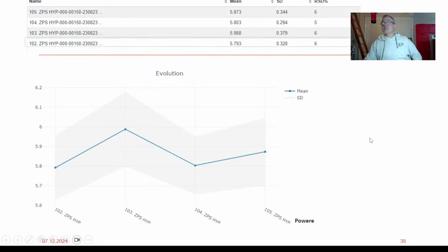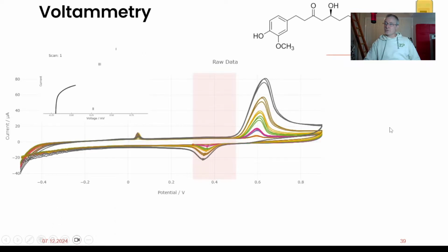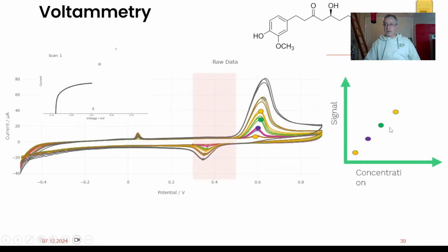Now, I will show you several days' worth of data, but just to say, it's a philosophical thing: sometimes when people ask me questions and I say, oh yeah, screen printed electrodes are good quality, I am definitely thinking about this type of application, the blood glucose type application, or the quick test I just did. I'm not necessarily thinking about some long-term testing in water. So we do have great repeatability, and we are able to make really good assays out of them.